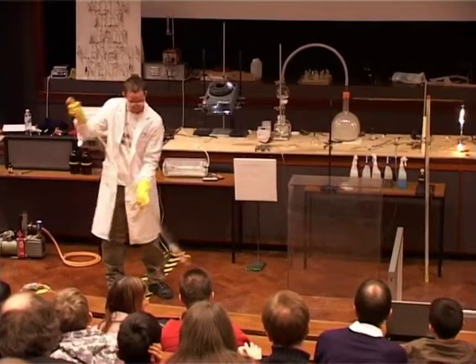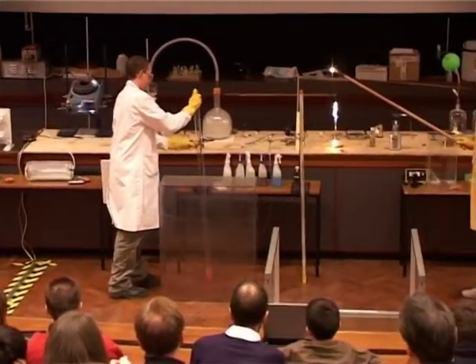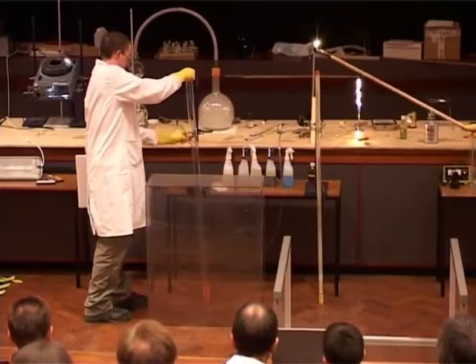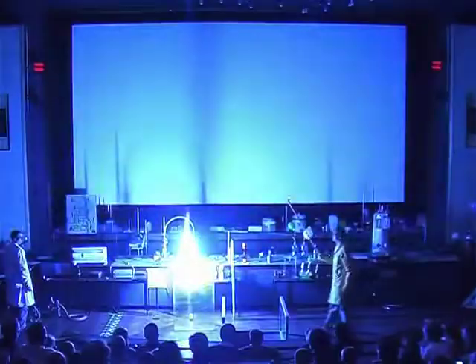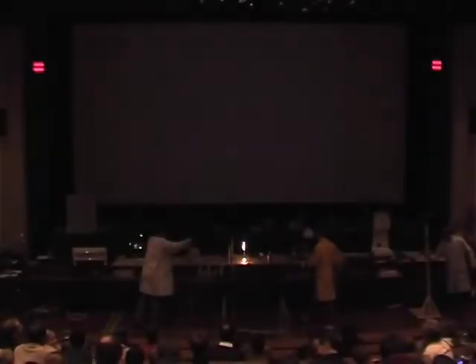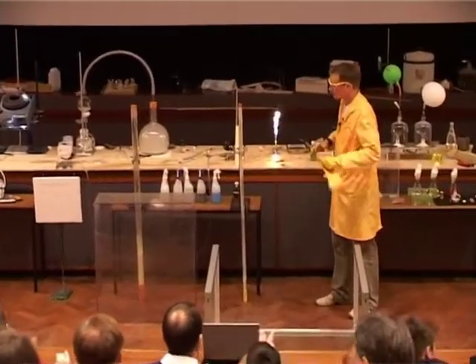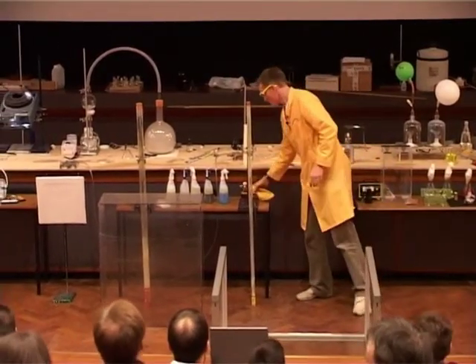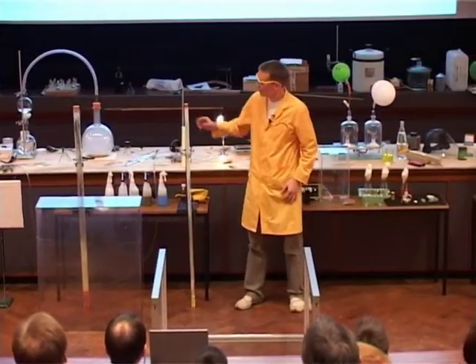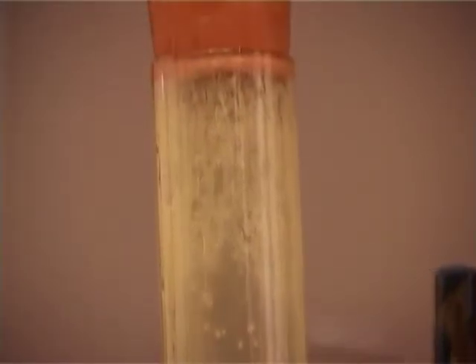So we're mixing the two together — the nitric oxide, NO, and the carbon disulfide. If we have the lights down please. Remember, the carbon disulfide contains sulfur, and the yellow color that we see here is due to the sulfur that's been formed in this reaction.